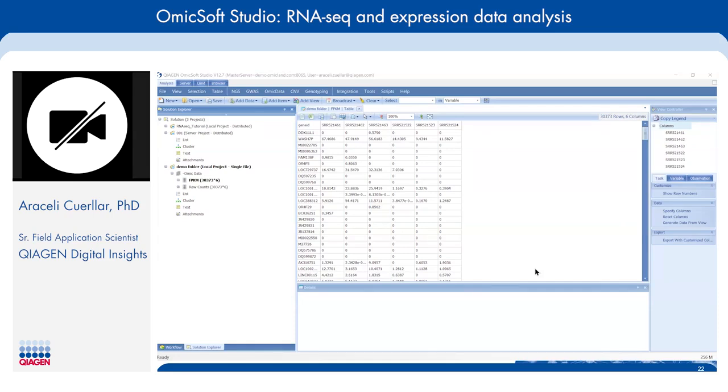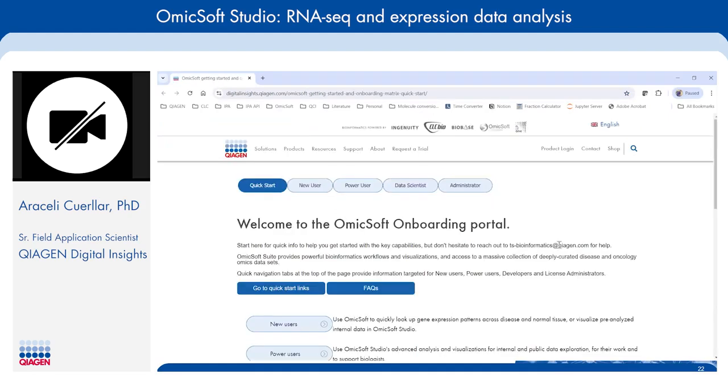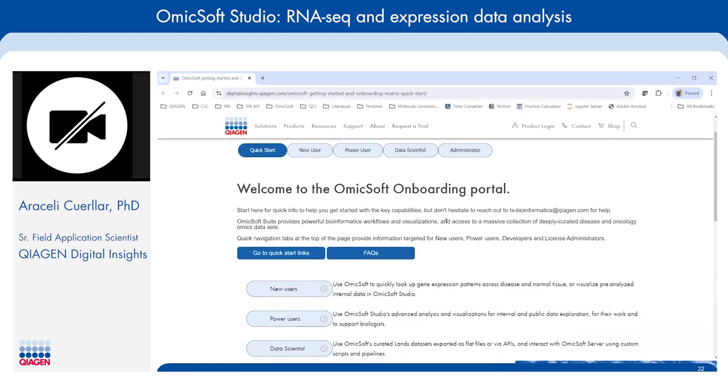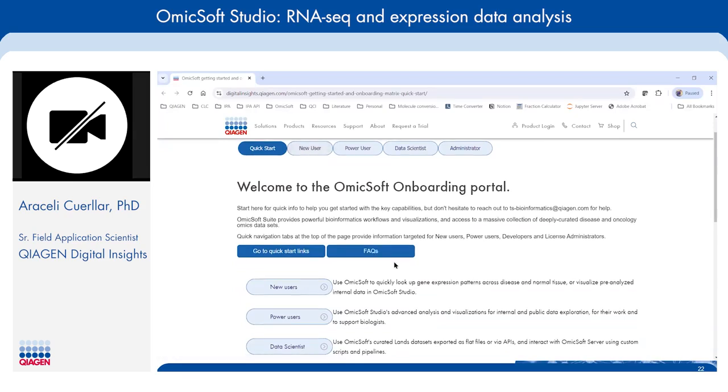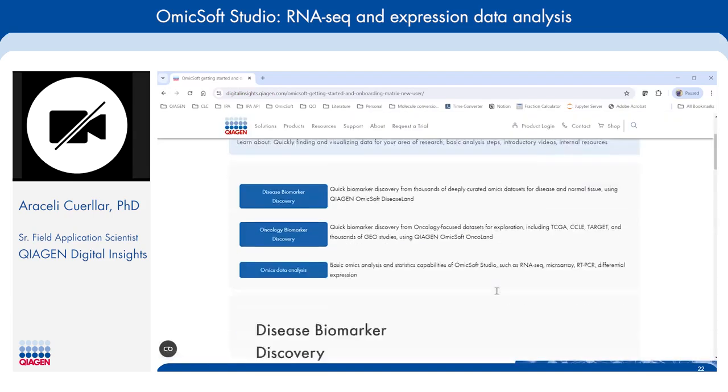Another question that came up is, what are some of the resources that are available for brand spanking new users to get started with OmicSoft? That's a great question. So if we go under help, we do have this option called Getting Started. And so this is going to open up a page in your browser that's going to provide you with our onboarding portal. And so here, if you're a brand new user, you can take a look at the different options that are available for you.